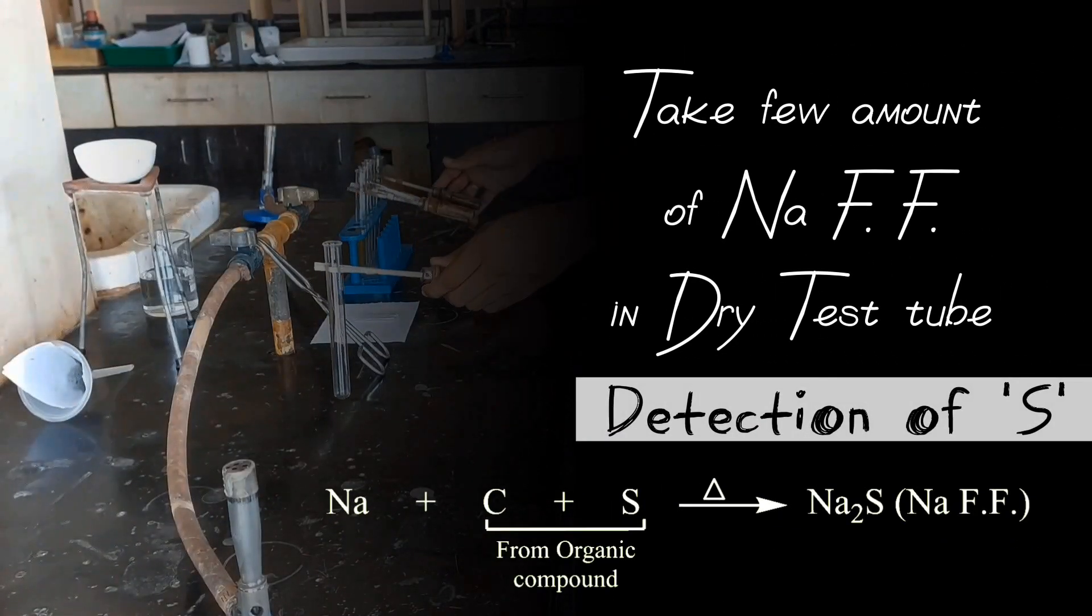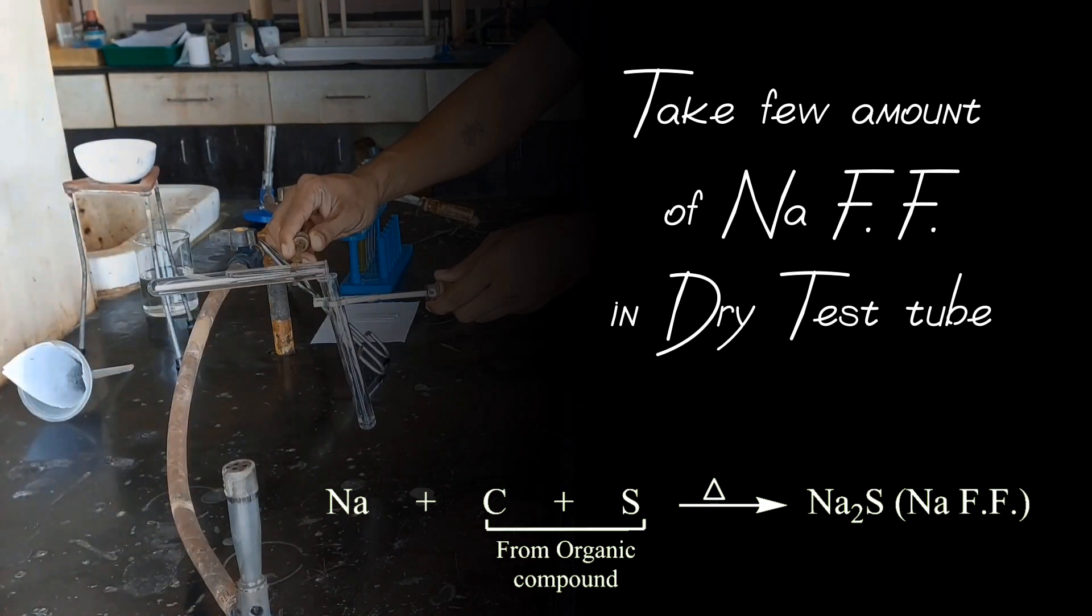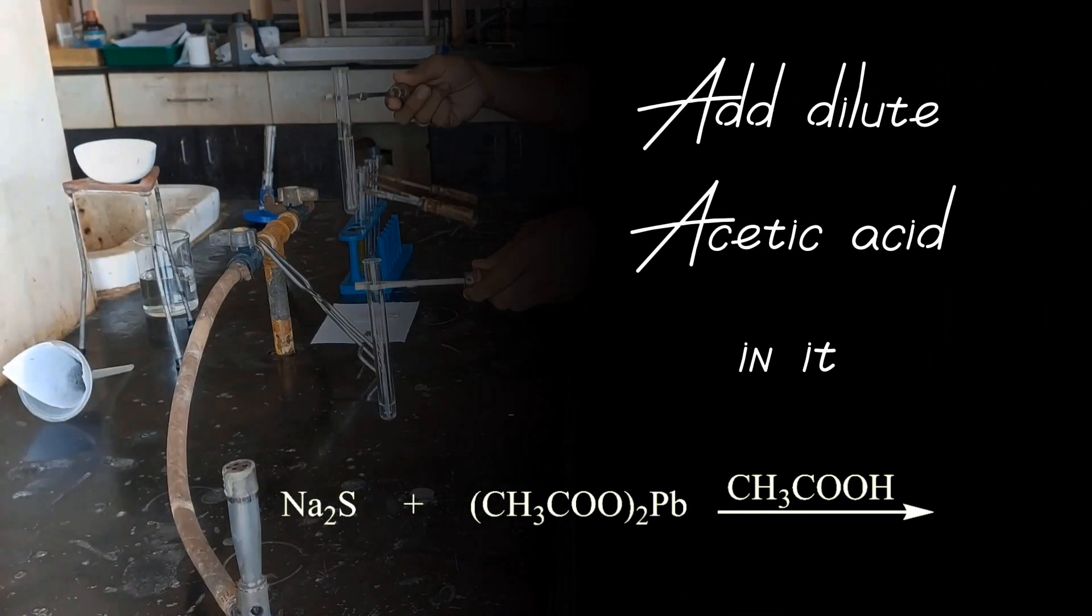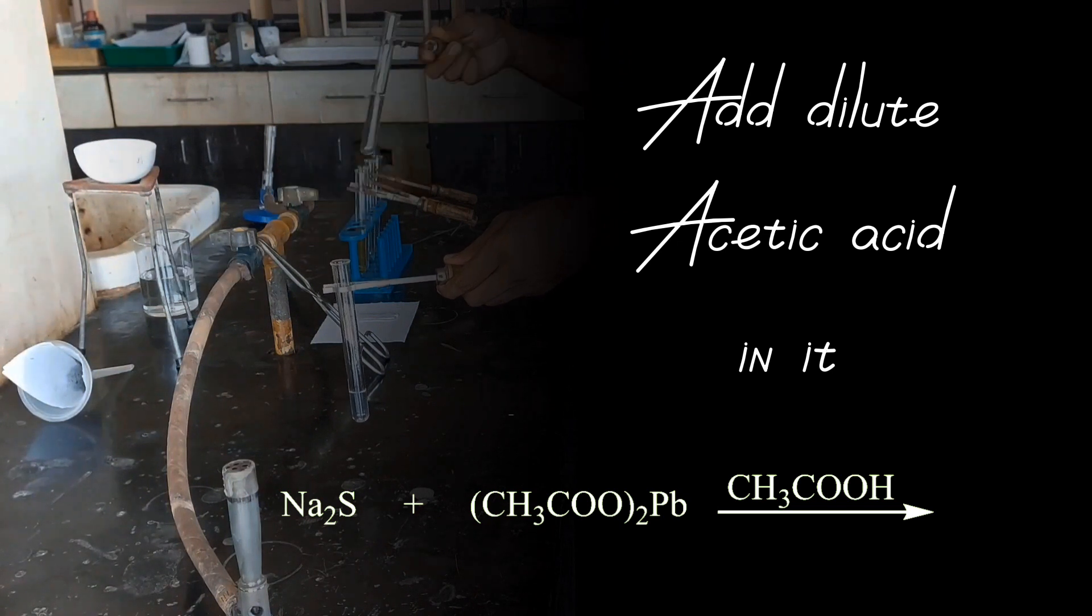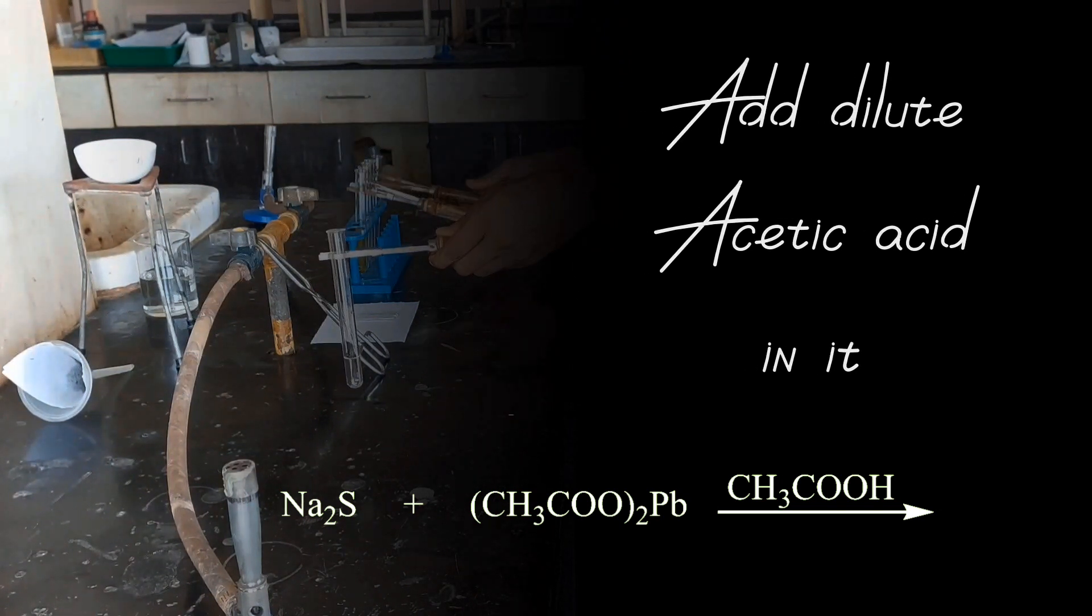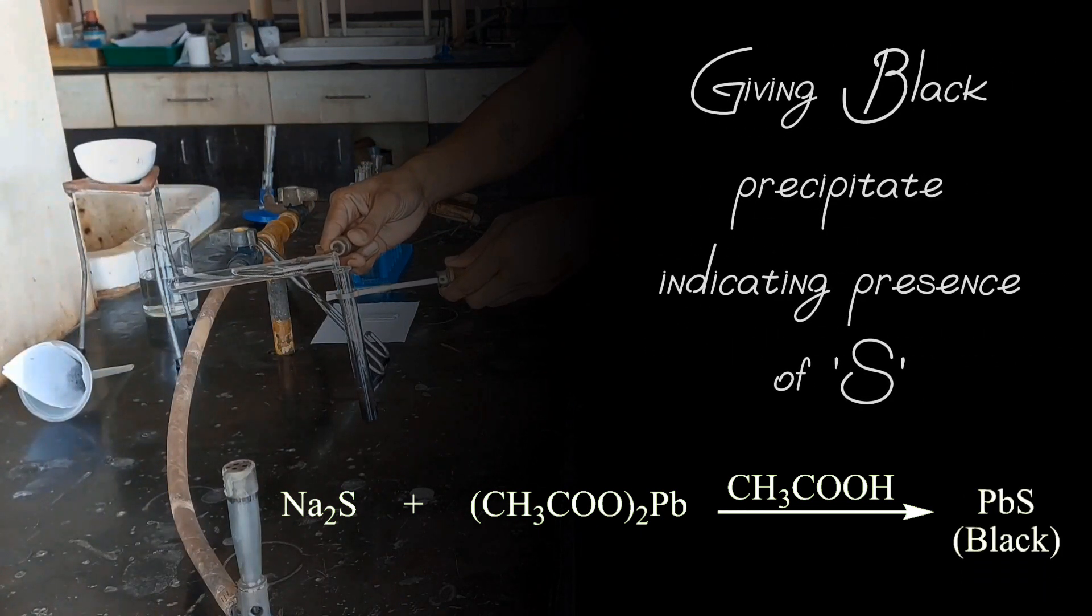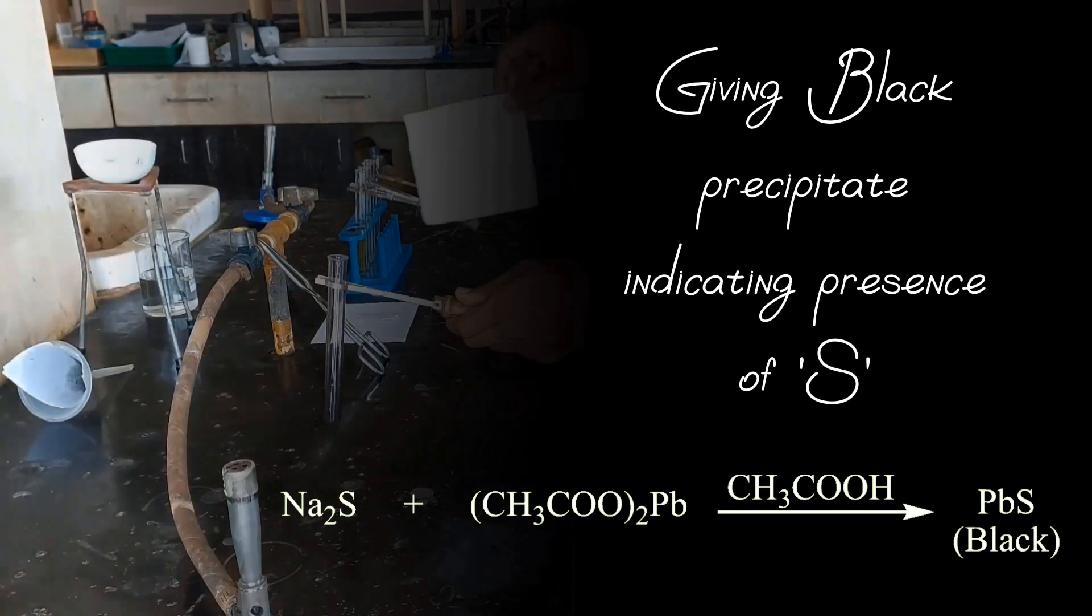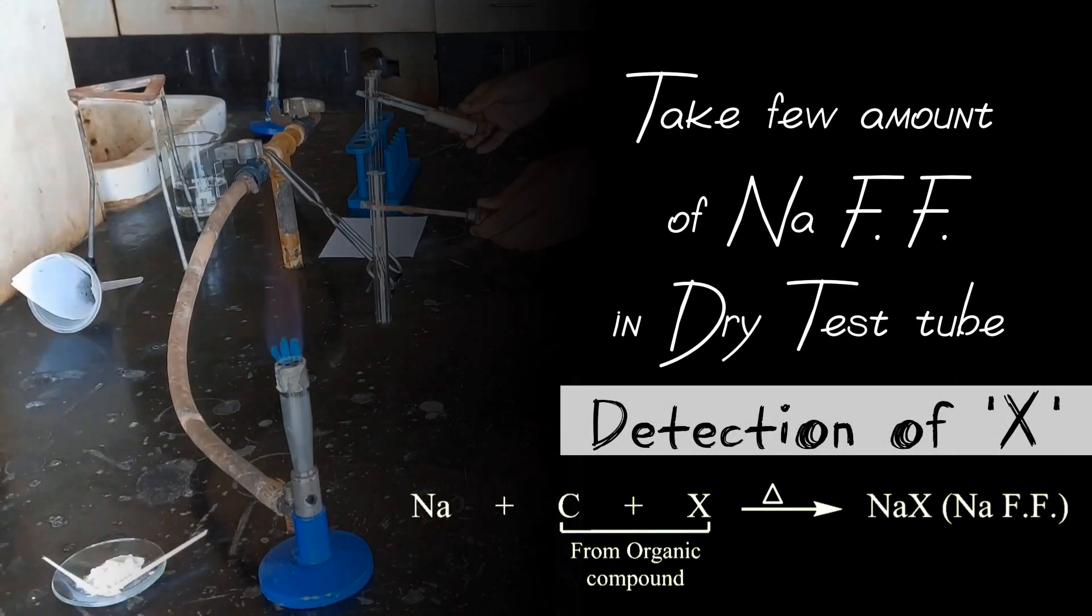Now let us do detection of Sulphur. Take few amount of sodium fusion filtrate in dry test tube. Add dilute acetic acid in it and add lead acetate solution in it. Boil it on Bunsen burner.